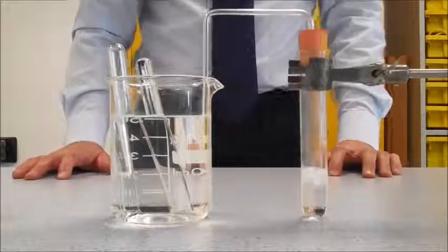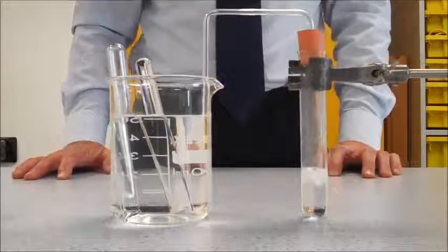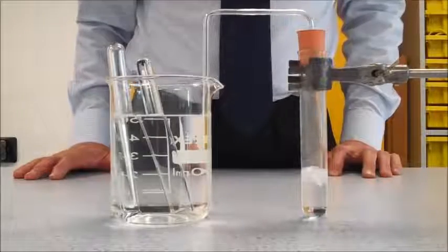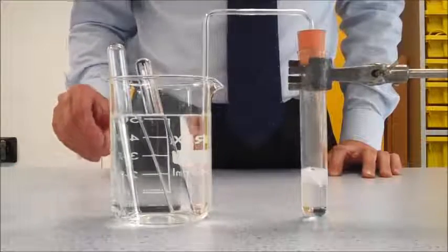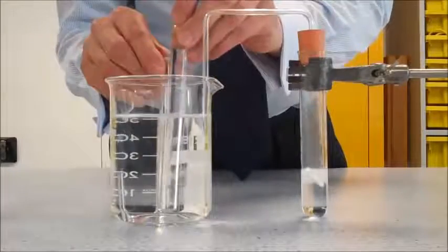As soon as a tube is full, gas bubbles begin to escape into the reservoir once again. This enables the user to choose when to replace the tube with another.